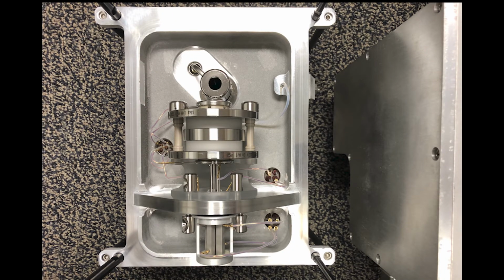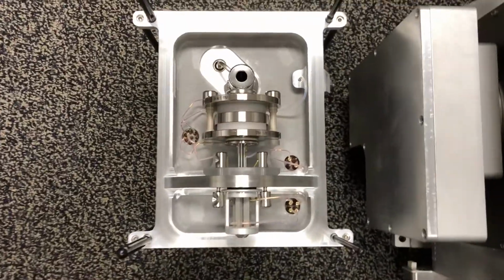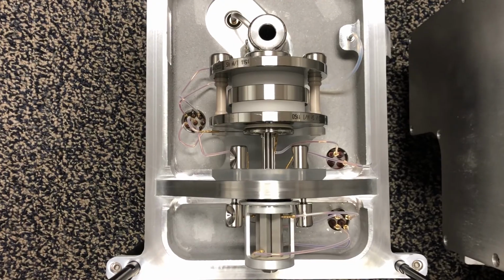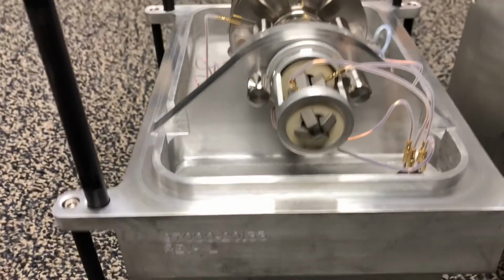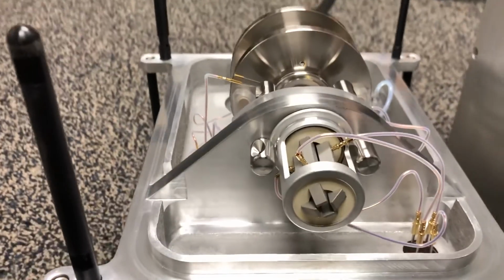So if we take a closer look here, the first thing that we're going to encounter is going to be a quadrupole ion guide. It's just got 4 square poles. So we'll sort of scoot on down the ground here and look a little bit down those poles. You see those 4 poles? That's a quadrupole ion guide like we were talking about before.